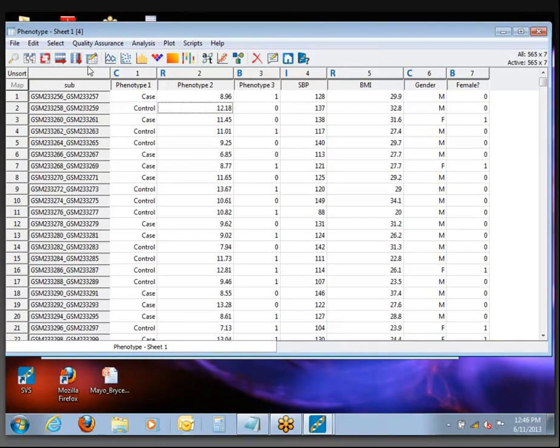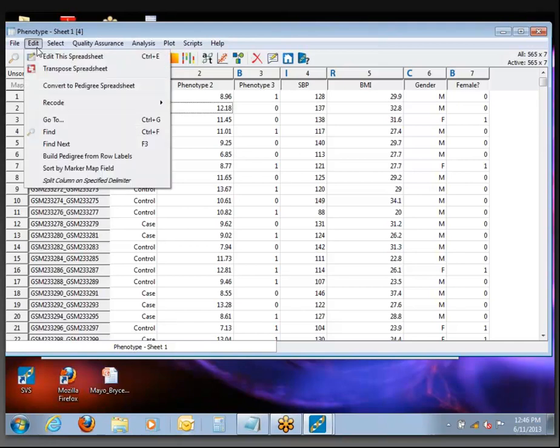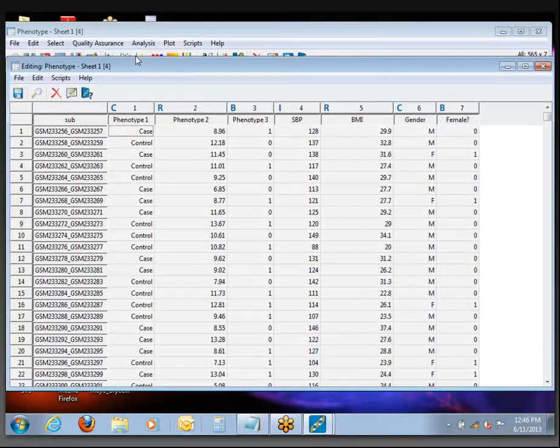If you ever need to make any changes to a data set, the way to do that is under the Edit menu. You see this item called Edit This Spreadsheet. There's also a keyboard shortcut, Ctrl-E, that takes you straight into the Editor mode. I tend to use the keyboard shortcuts a lot.